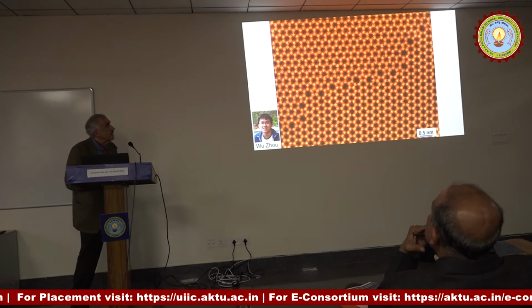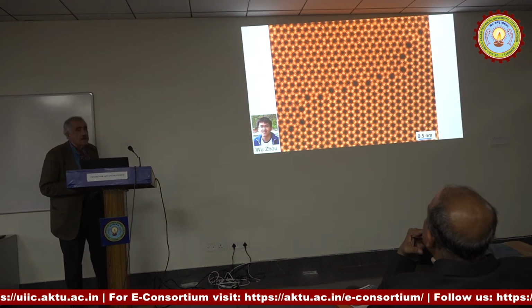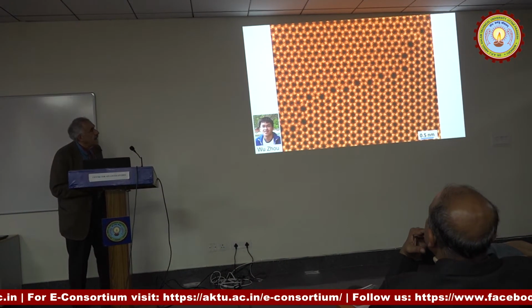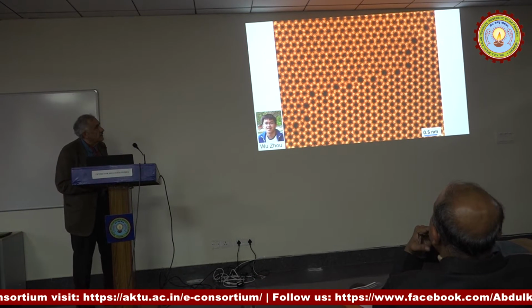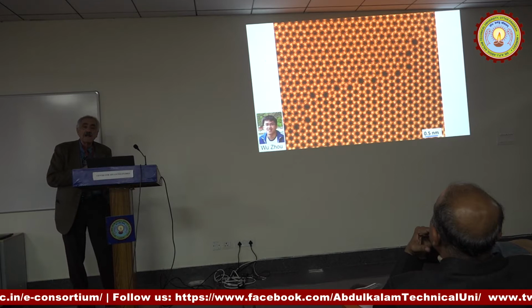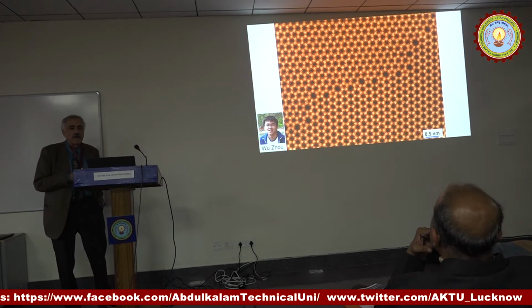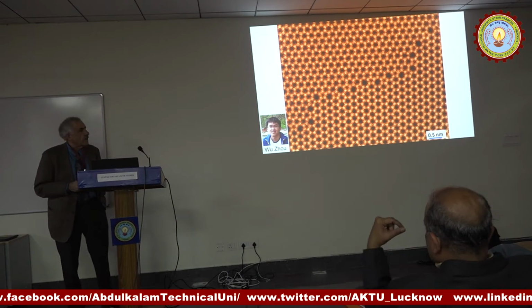Here is an image of graphene, a truly stunning image, taken by one of those microscopes. Every one of these bright spots is a carbon atom. You are looking, ladies and gentlemen, at individual carbon atoms. This is a photograph of them. The colors are arbitrary, we choose the colors.